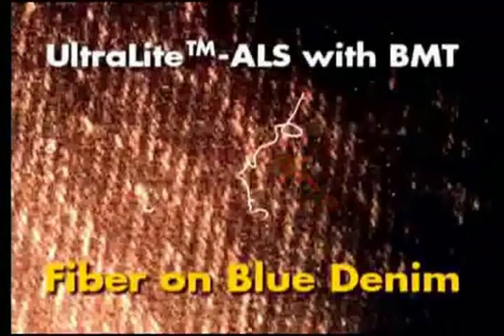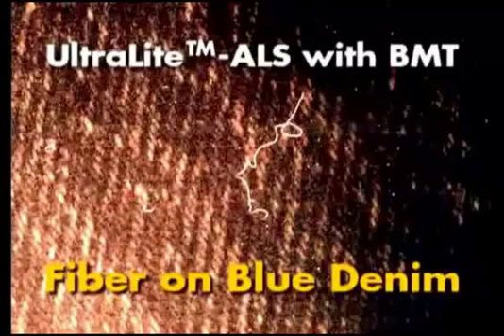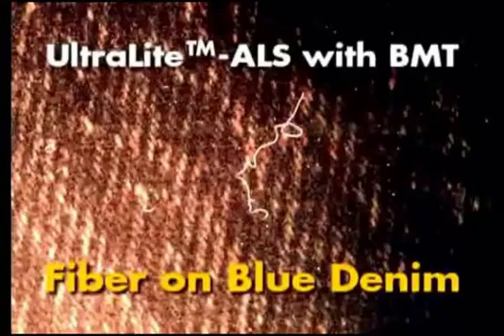Blue Merge technology will help you find the vast majority of fibers. However, different fibers fluoresce when illuminated with different wavelengths — some fibers will only fluoresce if illuminated, for example, with red light. Therefore, for complete fiber recovery you will need to use all heads.